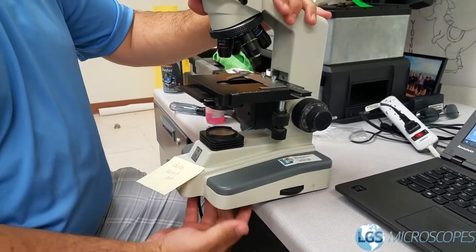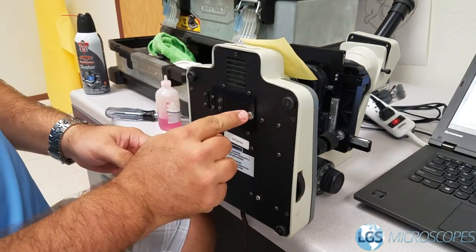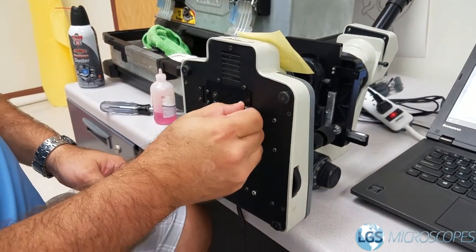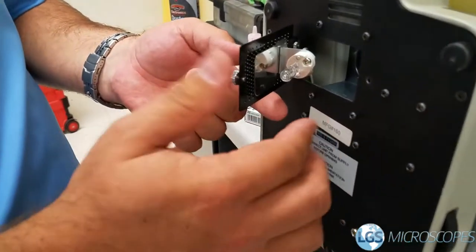A lot of times on the bottom there's going to be an access panel. You can use a flathead screwdriver, or sometimes it's just finger loose. So I open this door — there's the bulb.